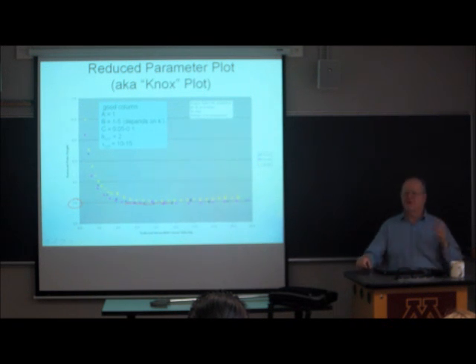So if someone asks you, hey, what's the best HETP I can get on these particles? All you have to do is say, what size particles are they? And you double it. And that's the best HETP you can typically get.